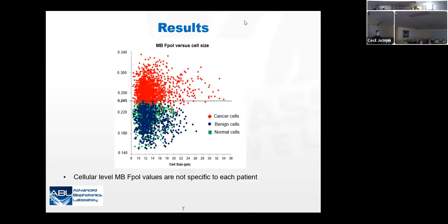This is a clinical specimen. That means that we don't have only thyroid cells here, but also other types of cells. We cannot choose what is pulled out. And that is why when I sent our pathologist, Andy Fisher, the images, he said, take a look, this is not a thyroid cell, and this is not a thyroid cell.